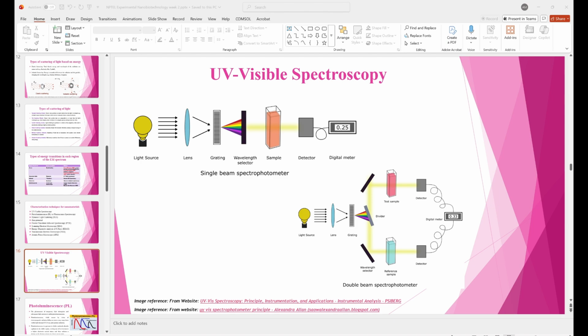Then what you do is you do a blank calibration and a baseline calibration. Okay, you do a baseline calibration first, then you do an auto blank, and after doing an auto blank you remove your reference, you put your sample in the same, remember you have to use the same volume of sample. So here the cuvette represented is a 3 ml cuvette. You should fill it 2/3, not more than that.